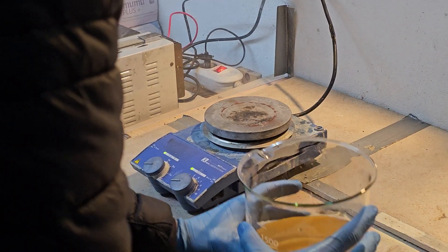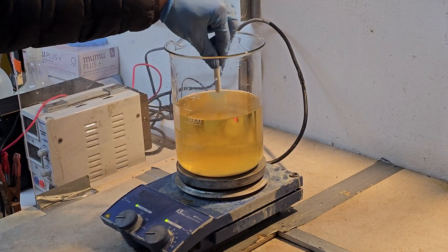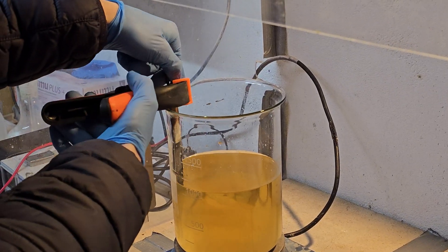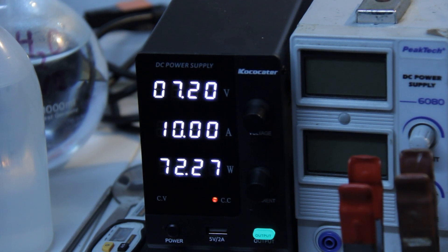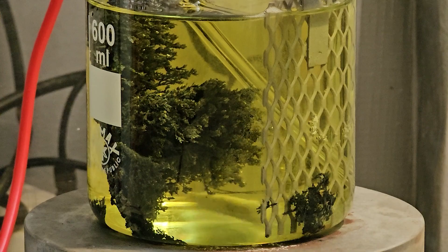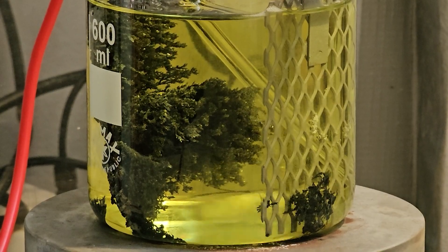With our solution prepared, we set up an electrolytic cell with a lead cathode and platinum coated titanium anode. Running an electrical current through the cell, we eagerly anticipated the crystallization of lead onto the cathode.